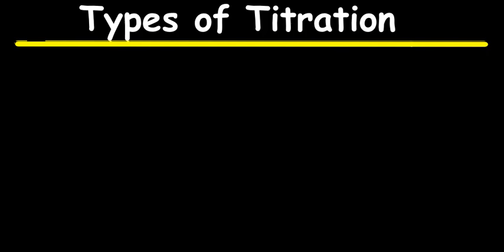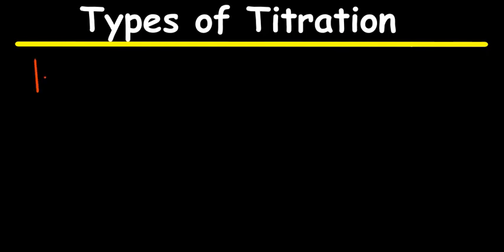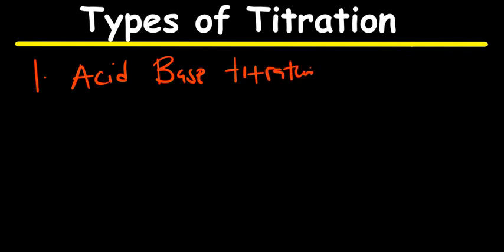However, what are the types of titrations? It will be based on what you're doing. Mostly the common one that you are going to do in the lab is the acid-base titration. Now, for this one, you are literally reacting an acid with a base. So let's say this is an acid plus a base. When you react an acid with a base, you're getting a salt and water.